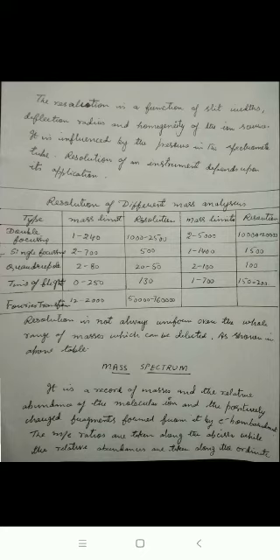The 100% intensity is the base peak or the molecular ion peak, and the other signals of m upon e are fragments or the daughter ions, which show the relative intensity, and the signals are on the abscissa as m upon e. So one can have the mass spectrum structure like this.